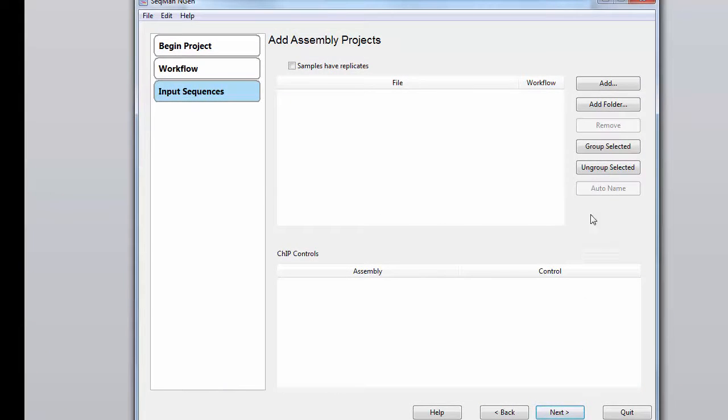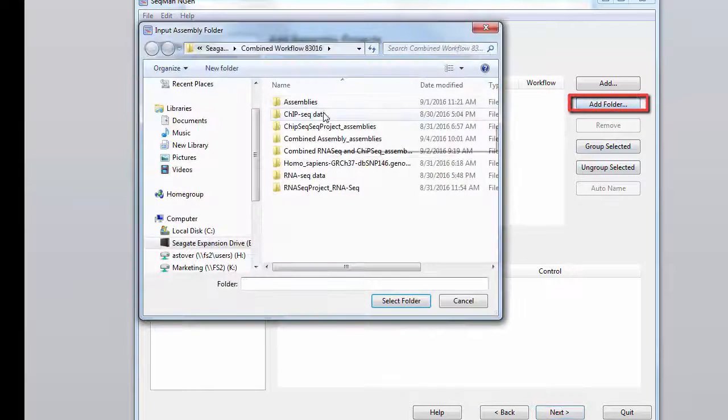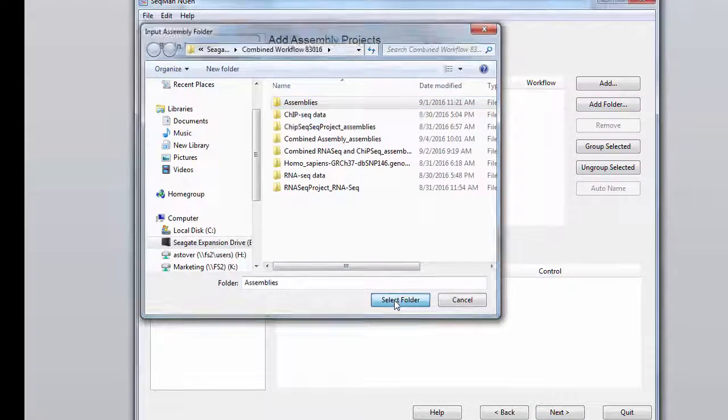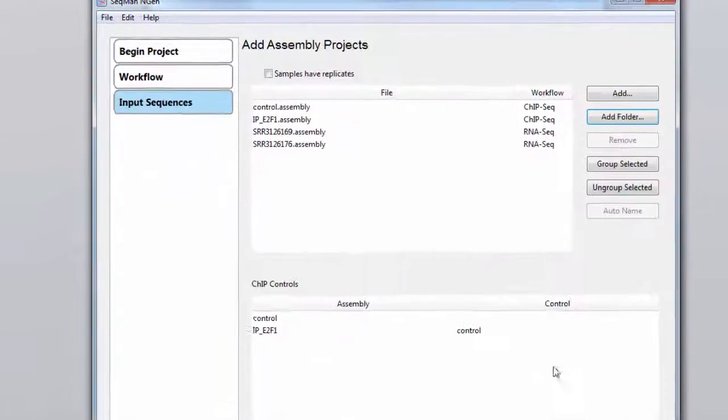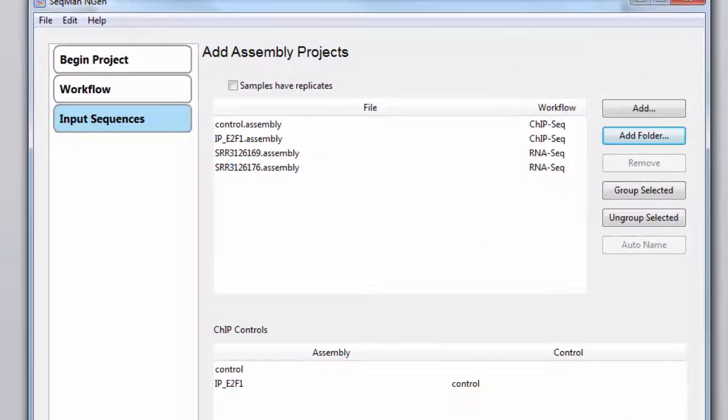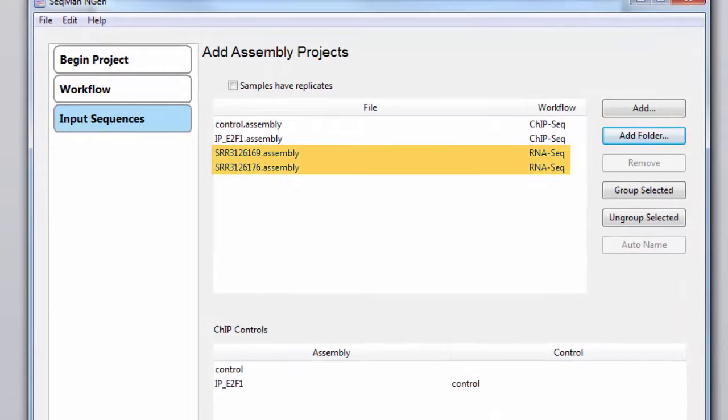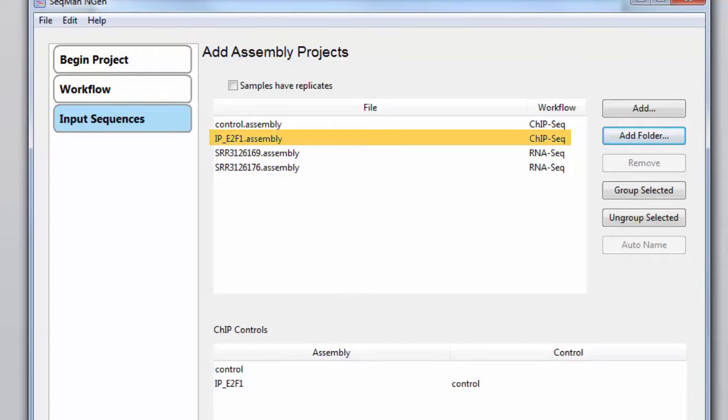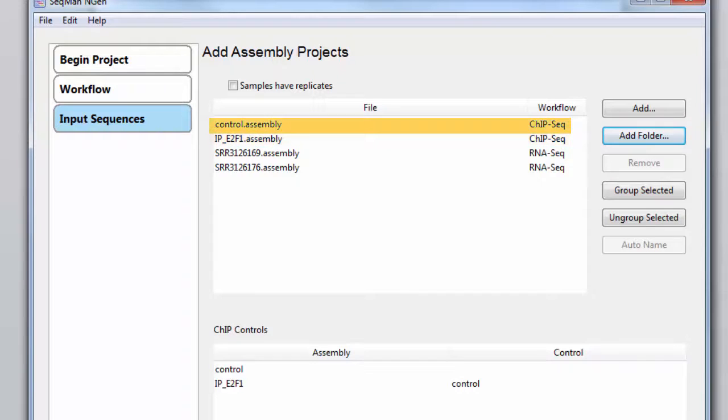The next step is to add the assembly projects you want to combine. Here you can see I've added two assemblies of RNA-seq data, each representing the sample at different time points. I have my ChipSeq assembly of the same sample, as well as a ChipSeq control. Notice that SeqMan Engine automatically identified the control for our ChipSeq assembly.